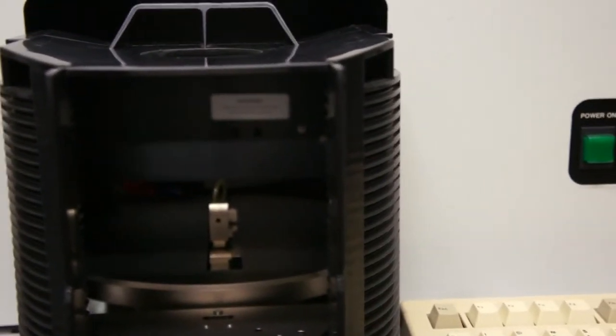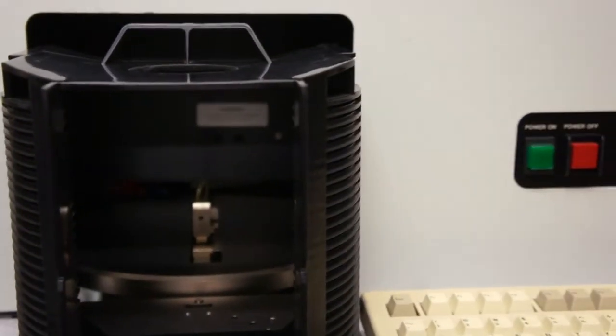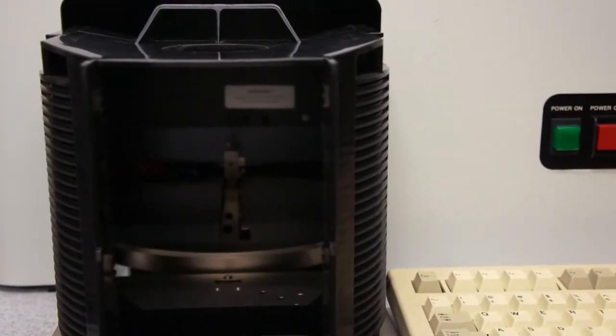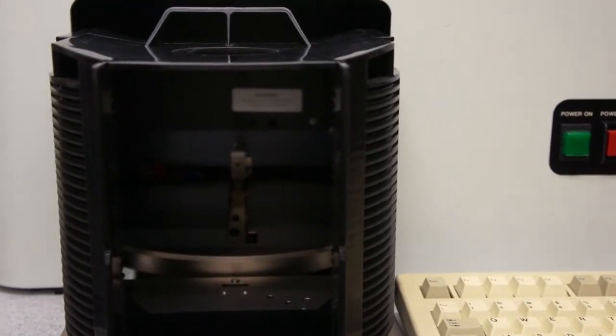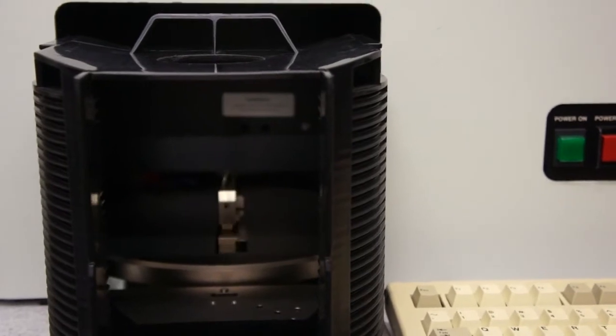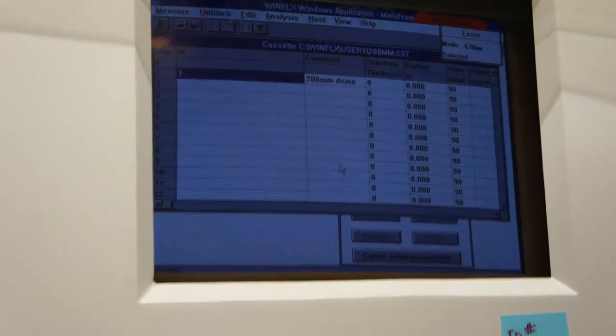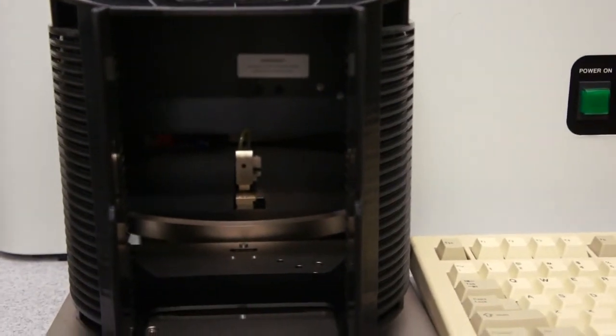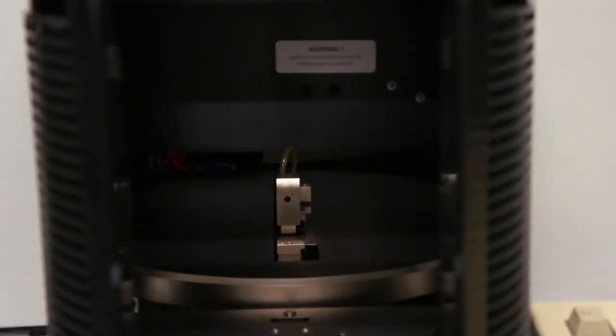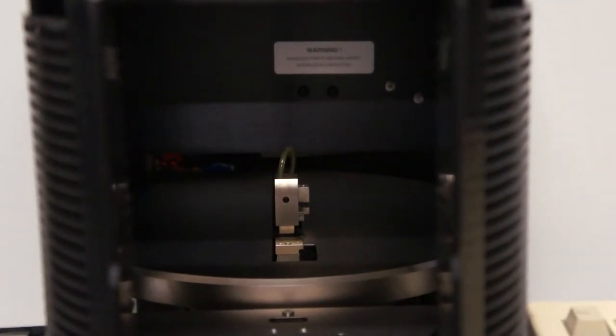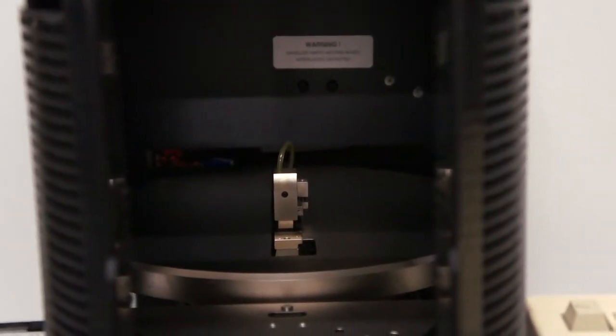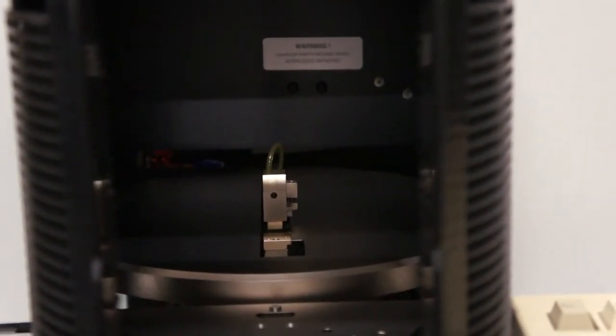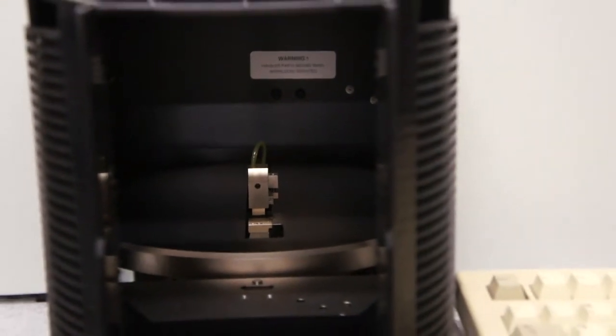A second part of the full proof of life video will show measuring a wafer set with stress measurement. So close the door, it's ready to take a measurement. Here we go.